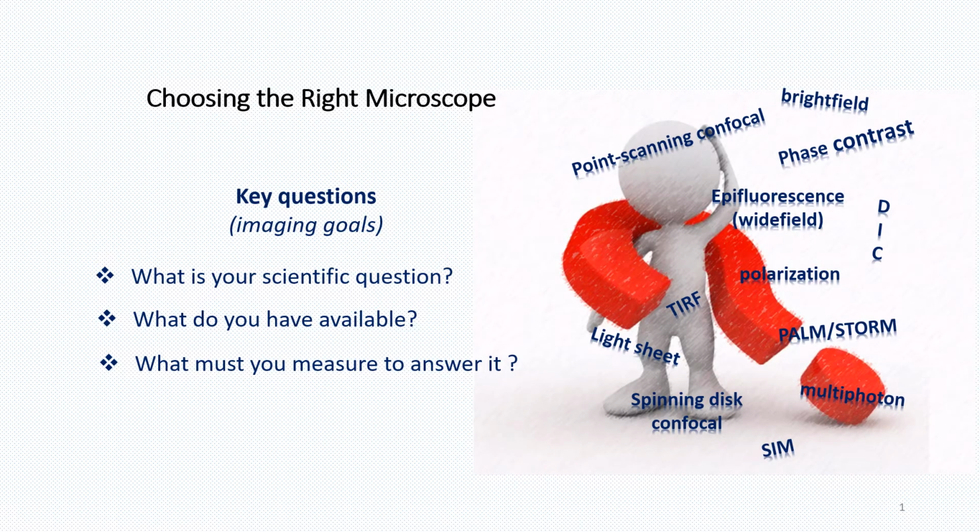Deciding which type of microscopy technique to use may seem a bit intimidating because there are several imaging modalities out there. In making this choice, the first thing that you have to ask yourself is what kind of scientific information are you trying to gather? What question are you trying to answer? And based upon that, you can think about what kind of image data you need to answer that question. This will guide you in deciding what kind of imaging modality will be the most relevant for answering your problem.